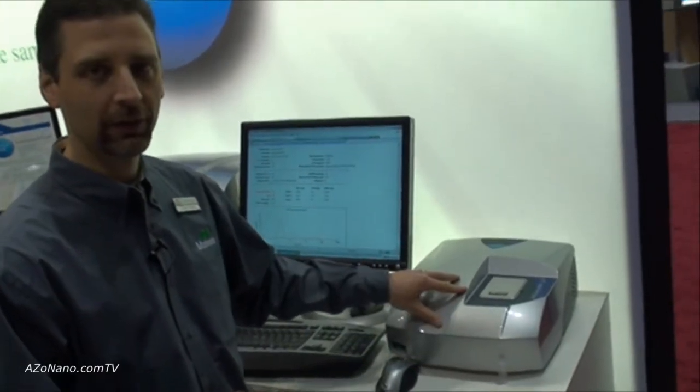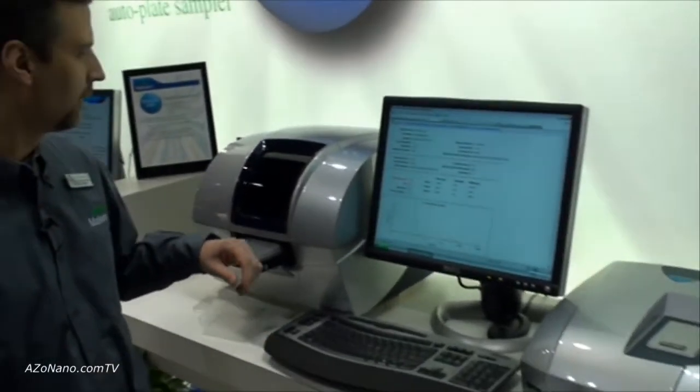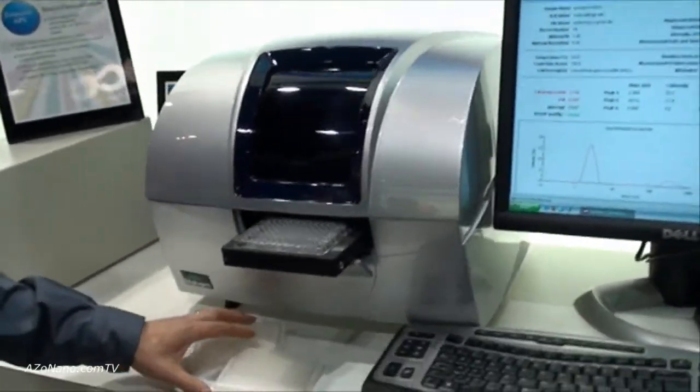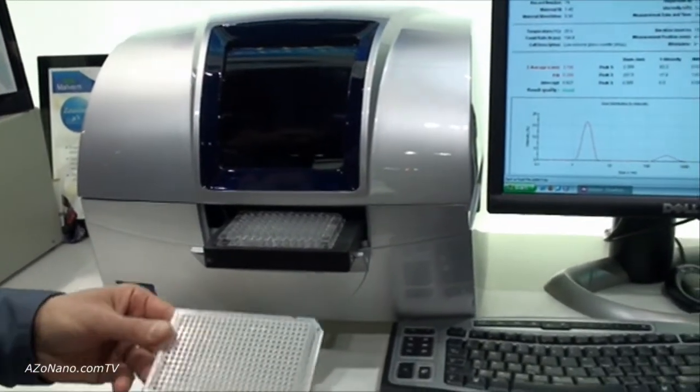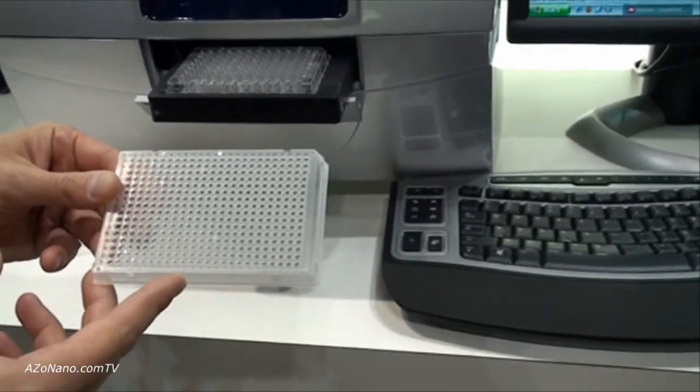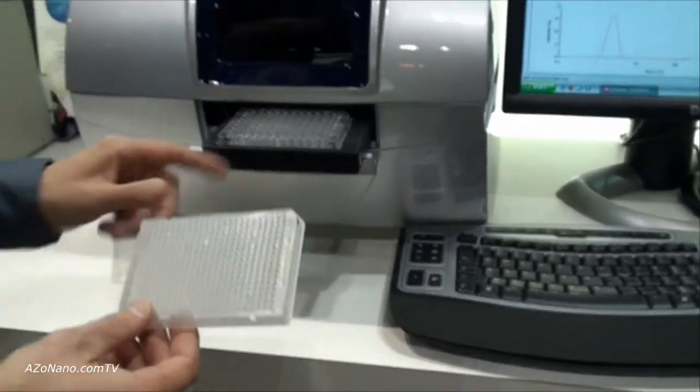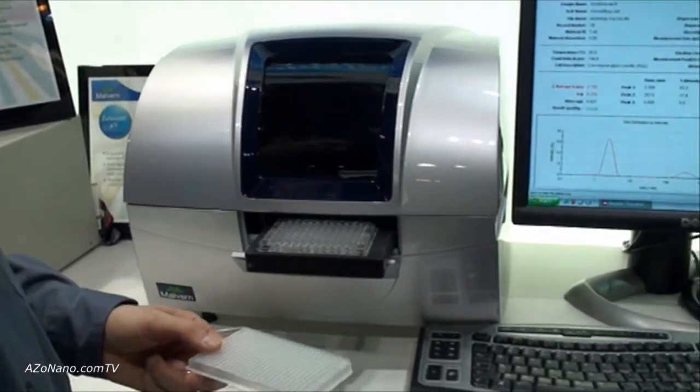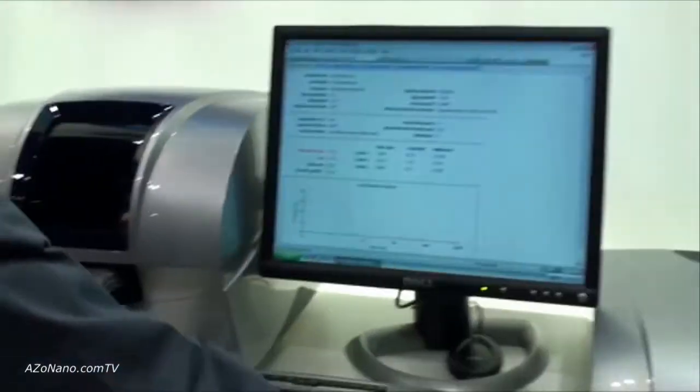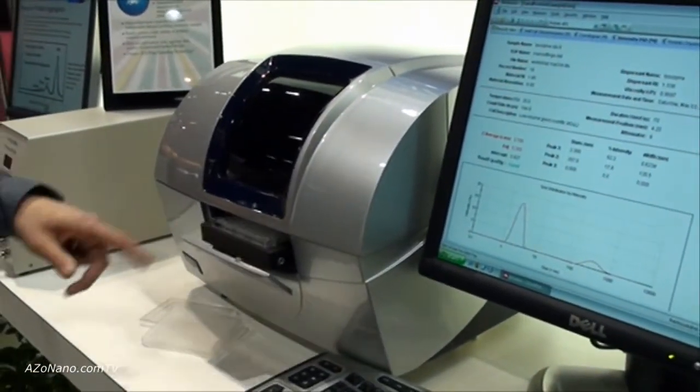Related to the Zetasizer Micro V is our other new instrument, the Zetasizer APS, which stands for Auto Plate Sampler. This will use virtually any industry standard 384-well or 96-well plate. The samples are prepared into the plates, and we simply place that plate into the instrument.